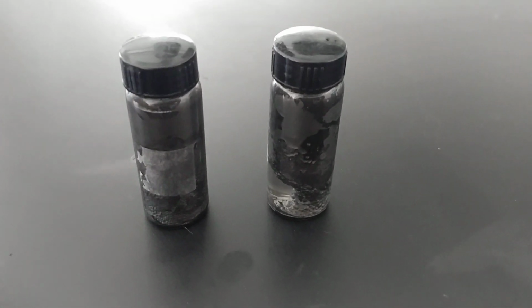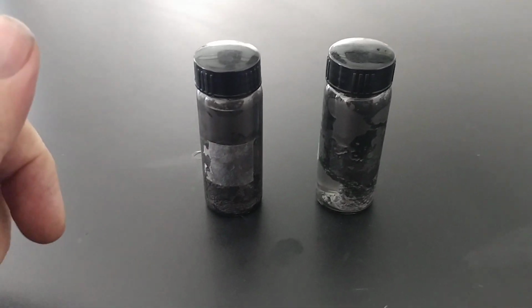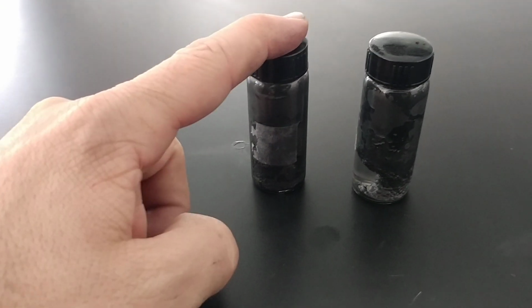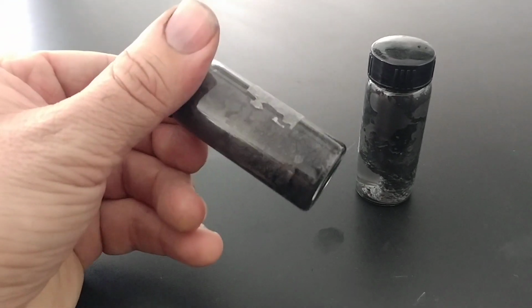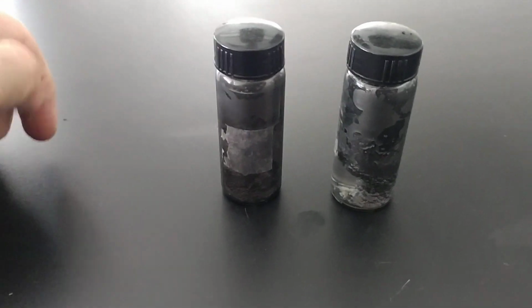You'll actually get to see a result before you even did anything. And again, like I said, graphite will mix all the way through. Graphene will separate and push its way out. It'll try to do everything it can to get out of the water.